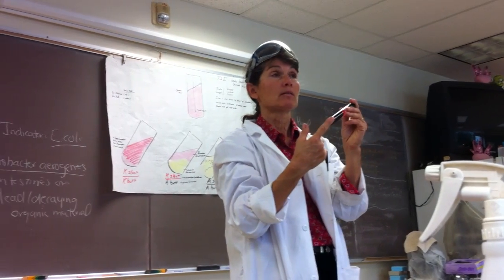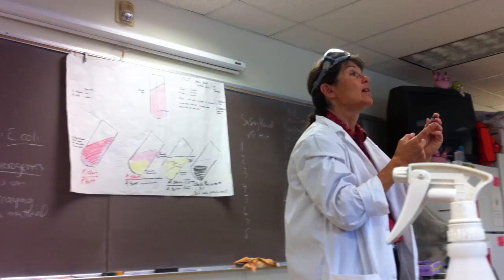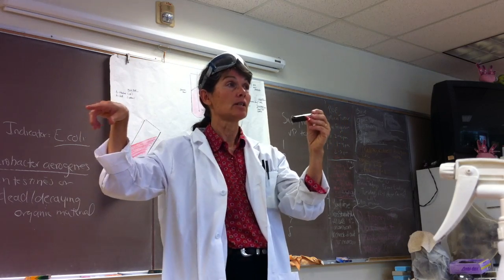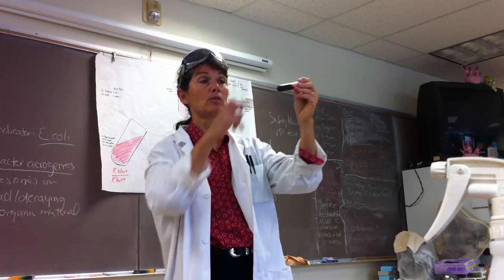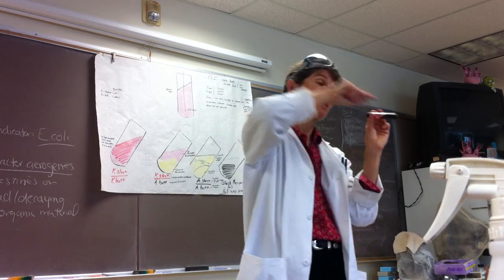Anaerobic respiration, right? Using what as a terminal electron acceptor? Sulfates, right? So that is a great way that some microbes make hydrogen sulfide. They use anaerobic respiration, with sulfates as a terminal electron acceptor. The sulfates can get reduced all the way to hydrogen sulfide. So that was one reason we wanted them growing anaerobically in the butt. That was one reason we wanted you to stab the butt.